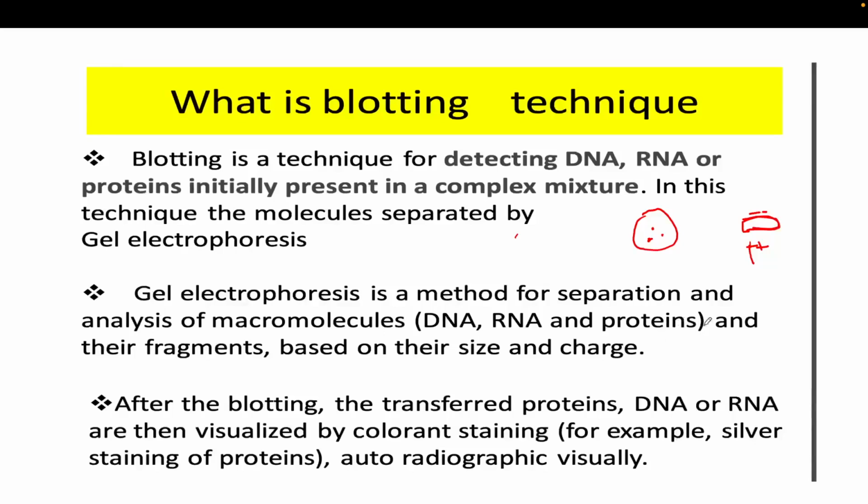Okay, so suppose there is a mixture of protein sample, and each protein has a different charge, right? So to maintain uniformity, we add SDS. It is a kind of anionic detergent. It will neutralize the separate proteins' charges, and it will provide the anion to these proteins. Now all the proteins in the mixture have equal charge, right? Now the separation will only occur based on their molecular weight.